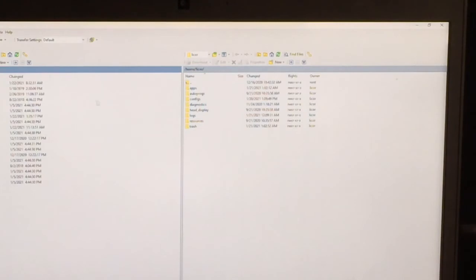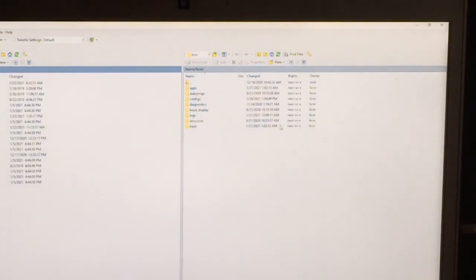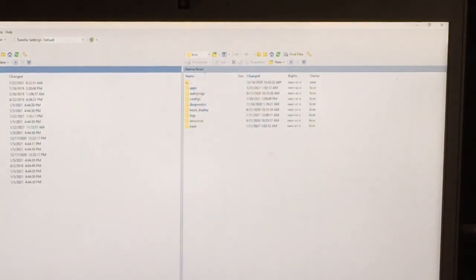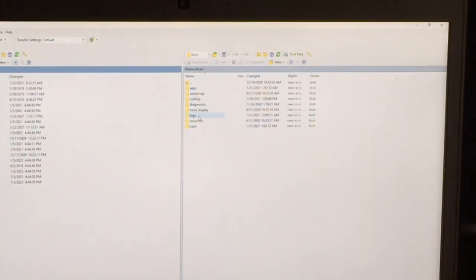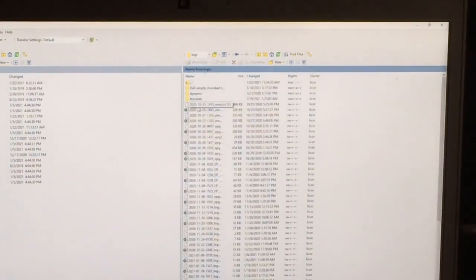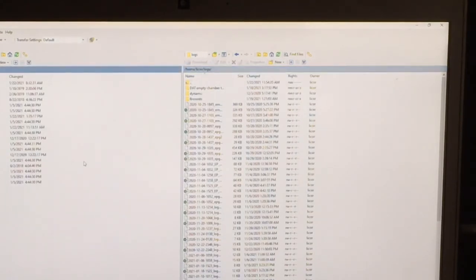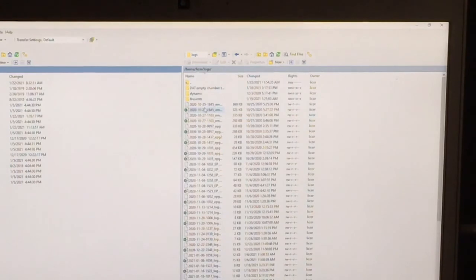On the left side, that's the folder structure on your computer. And on the right side, that's the folders in your instrument. The data files are in the logs folder. You can simply drag the file you would like to transfer to the location on your left, or just copy and paste that folder to your location on your computer.